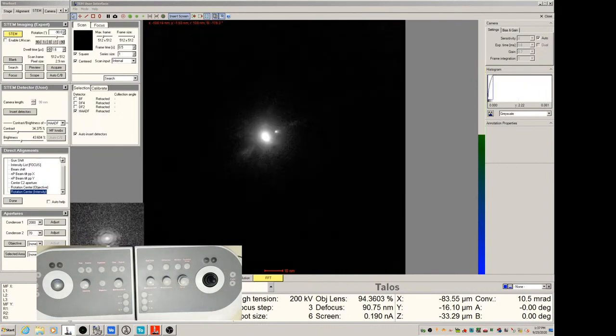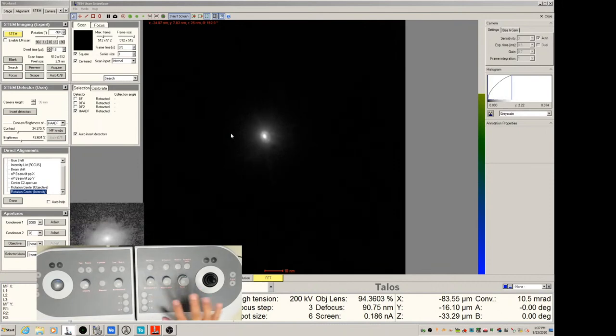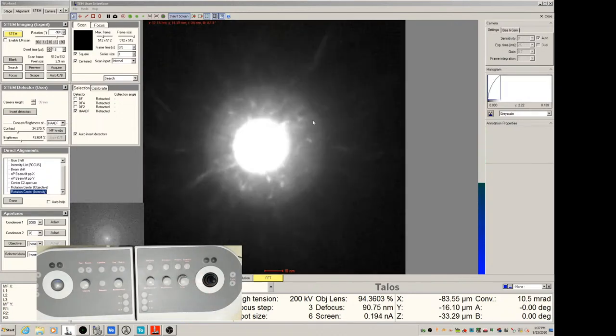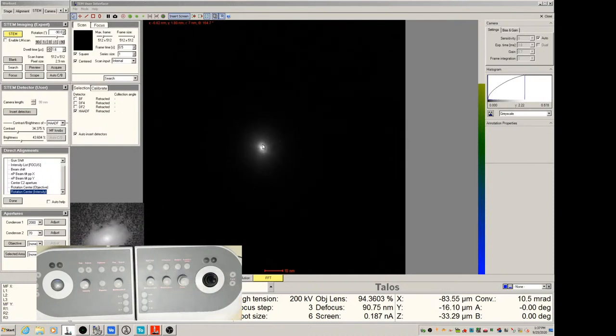And right now when we are at the rotation center intensity, we should be able to change the magnitude of that wobbling using this focus step. So if you turn it fully counterclockwise, so right now you see that wobbling stopped. But if you change it to clockwise, now you see it's wobbling with a very large magnitude. So right now we want the wobbling to stop so that we can see this center spot and this shadow clearly.